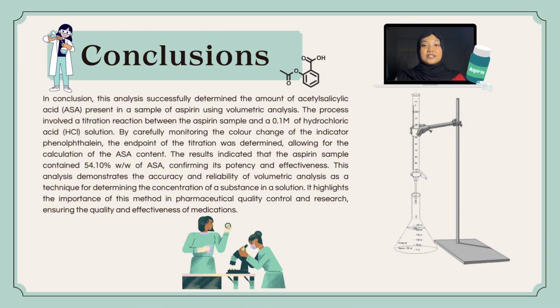This analysis demonstrates the accuracy and reliability of volumetric analysis as a technique for determining the concentration of a substance in a solution. It highlights the importance of this method in pharmaceutical quality control and research, ensuring the quality and effectiveness of medications.